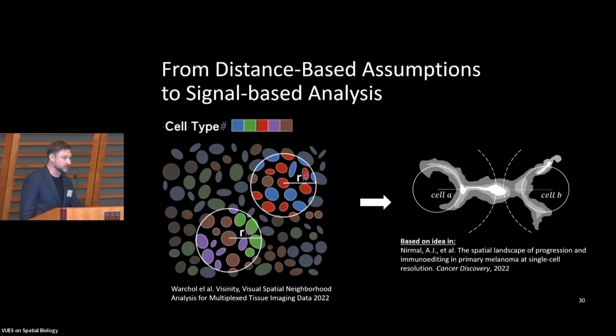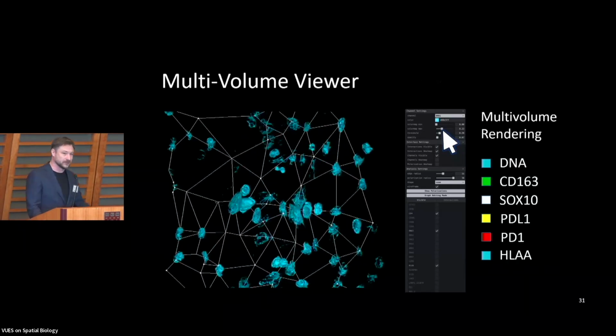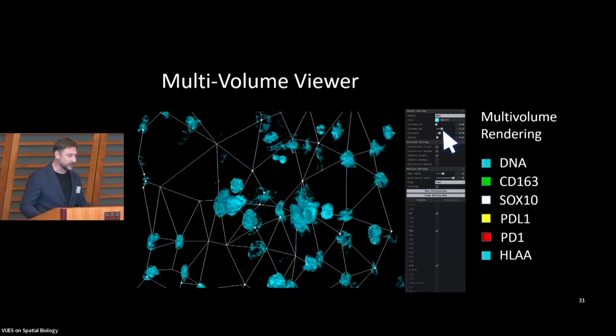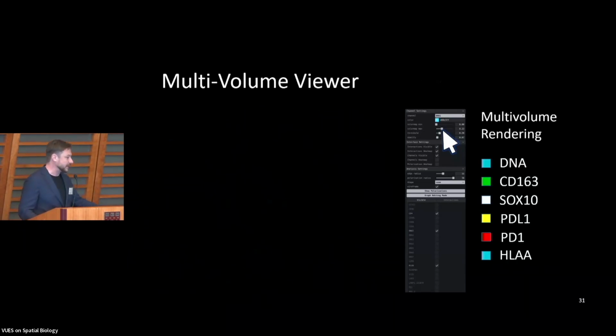And we wanted to make this approach a little bit more scalable and integrated into a visualization tool. So here is our volume viewer. And this volume viewer, I have to admit, does not yet use the residency octree because it is not ready to be integrated in this tool yet, but it loads a smaller volume, so it's fine here.